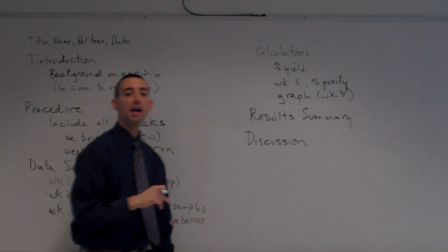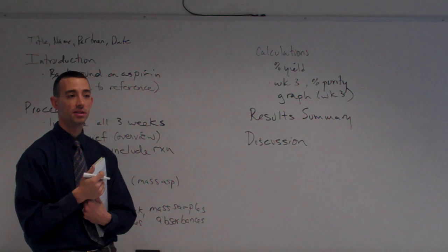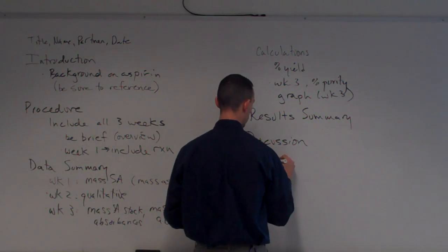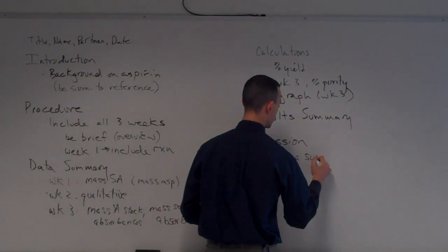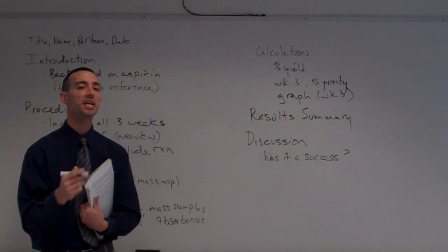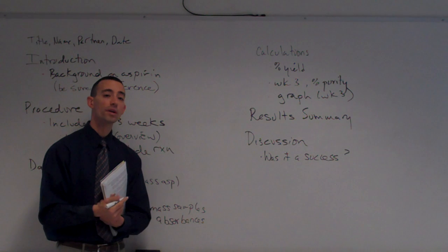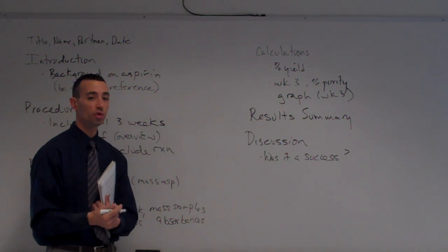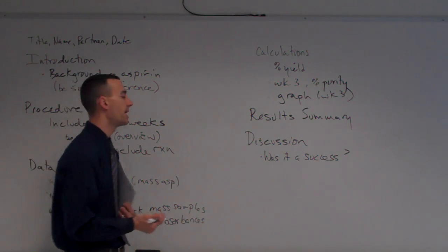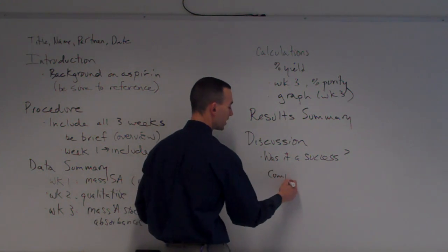And more so than any other experiment, you should have plenty to discuss with your aspirin. Again, the idea of the entire experiment was: was it a success? You began this experiment with salicylic acid. Did you end with salicylic acid, or did you end with aspirin? Do you literally believe that what you have is now aspirin? Compare the purities.